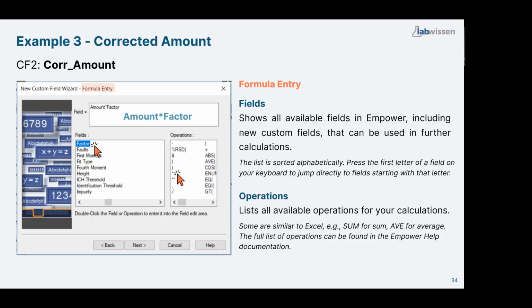Great thing here, it's more relevant for very big formulas. You can write them in Word, yes, and then copy paste. It's only necessary when you have huge formulas, but copy paste works if you need it. Okay, let's go further.